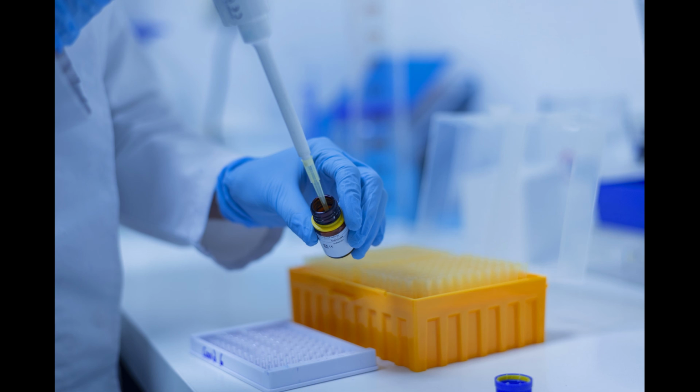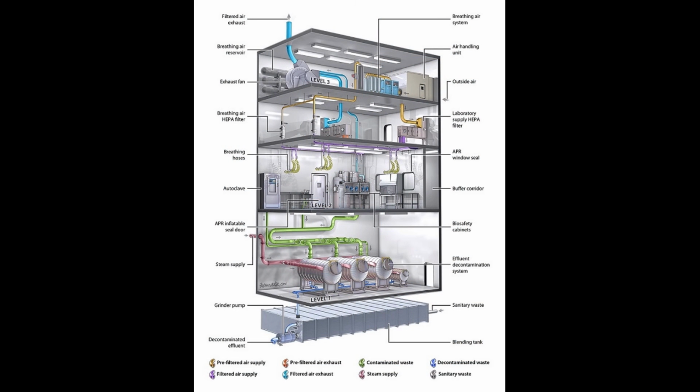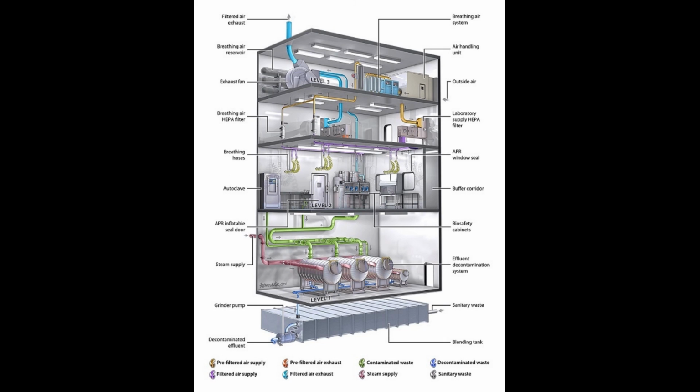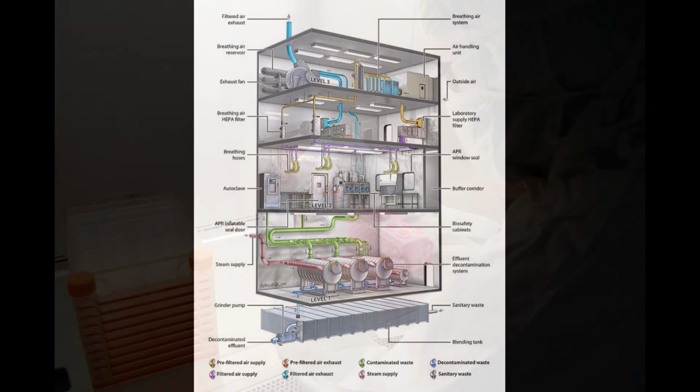The laboratory itself is even more difficult, and we've already mentioned that these are incredibly expensive facilities. One of the reasons for this is that they must be a separate building, or in an isolated section of an existing building. Access to this must be restricted to some of the highest levels possible. The laboratory itself must have a dedicated supply of air, as well as a dedicated exhaust system. This exhaust system must allow for decontamination of all the air that passes through it. Further to that, any physical matter going through that air system has to be vacuumed out.